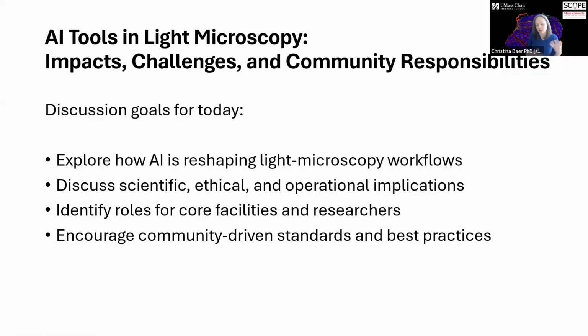So we're going to talk some about how AI is reshaping light microscopy workflows, discuss some scientific, ethical, and operational implications, possibly identify some roles for core facilities and researchers, and encourage some community-driven standards and best practices, which I think we as a community can work on developing together.